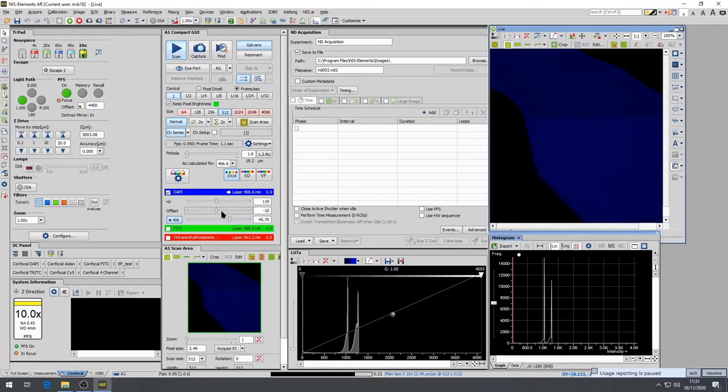Once you've selected the FITC channel, go to the next one and adjust all of them.